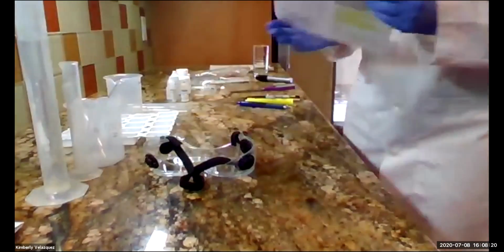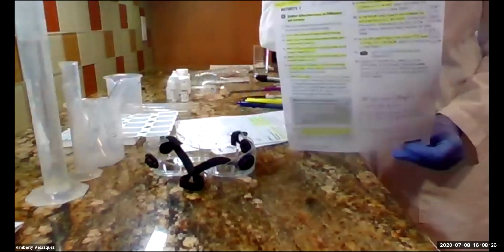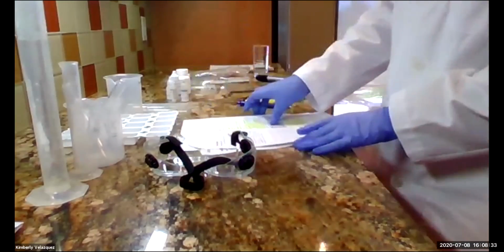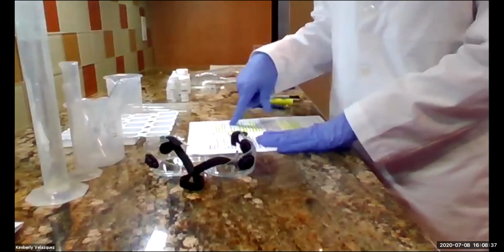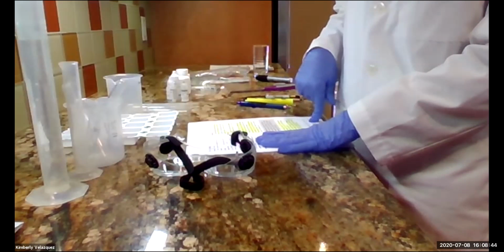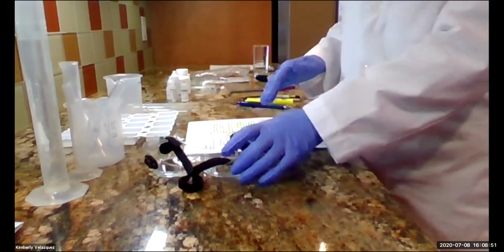And also you can see that not only have I highlighted, but I've also gone through and written detailed directions for what to do. This is a pretty complicated lab. So the preparation that they take you through goes through activities 1 and 2. Honestly, I like to do all the prep for activity 1 first, do the activity, and then go back and do the prep for activity 2, and then do the activity. So I'm just going to go through this. I know you guys can read, but there are some things I want to show you.